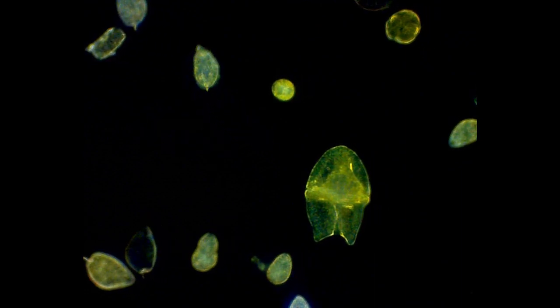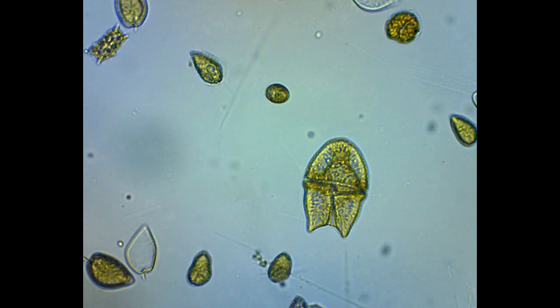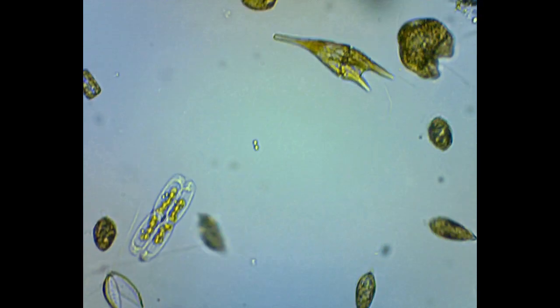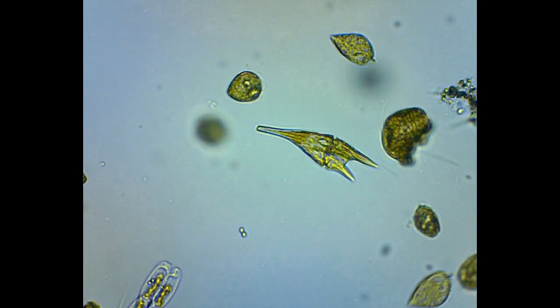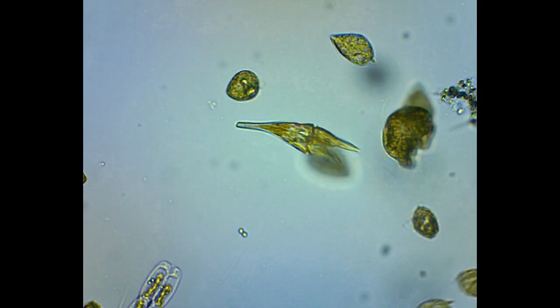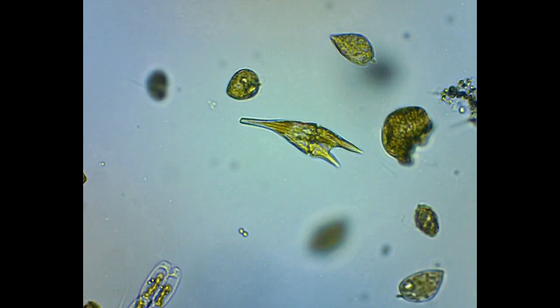So switching back to brightfield, you can now see a serratium coming into view with its flagellum that propels the dinoflagellate along.